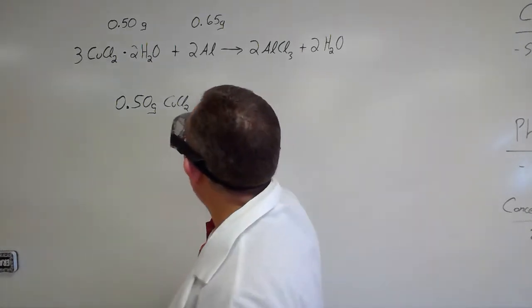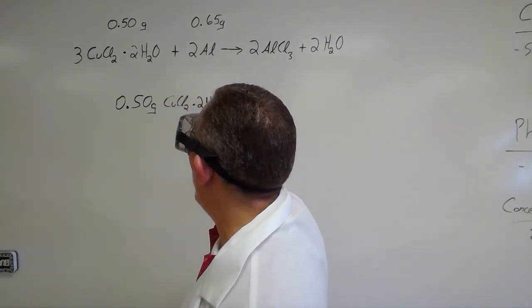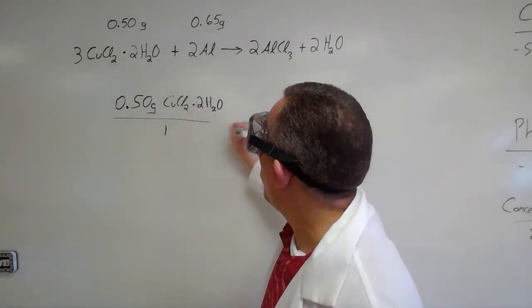So I'm going to take this. This is not just CuCl2. This is CuCl2·2H2O. I'm going to put that over 1.